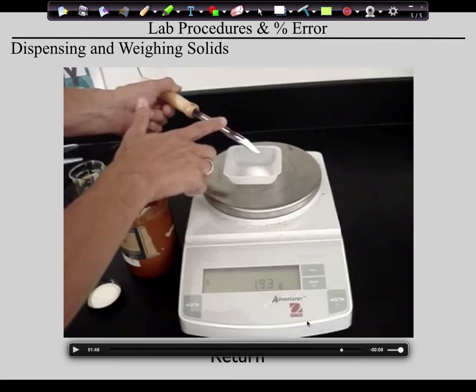No, that's a good point. If you can make that happen, that's actually a better way to do it: scoop it out of the boat so you're now under 2 grams, tap in what you need, but now the stuff in the spoon can't go back, right? Here's the thing. If you were in a college lab, I would have had to say no, and think about why. What do you know about the stuff in the boat? Contaminated, right? So if you put that spoon back in there, you've now contaminated your spoon. That was college training just coming out of my mouth.